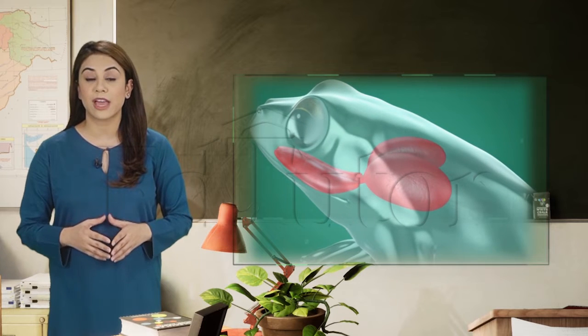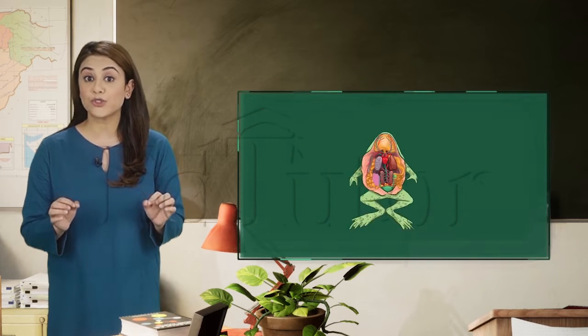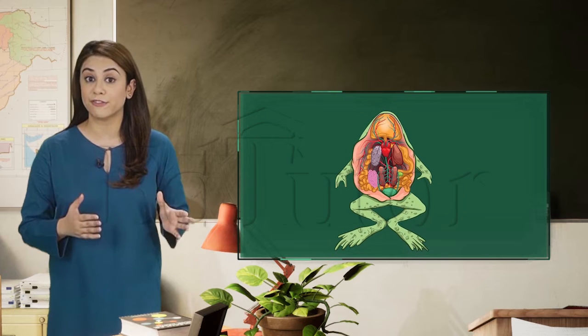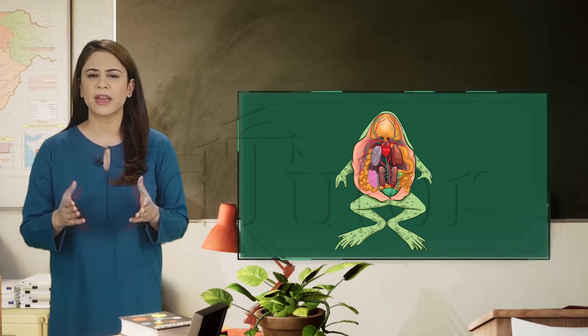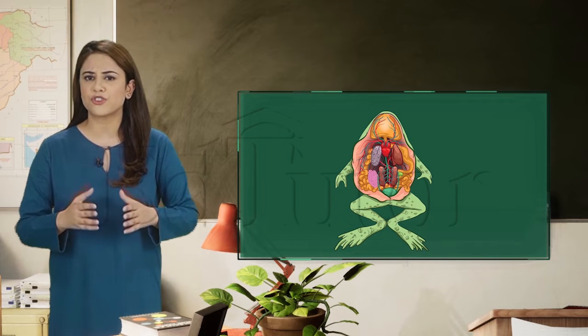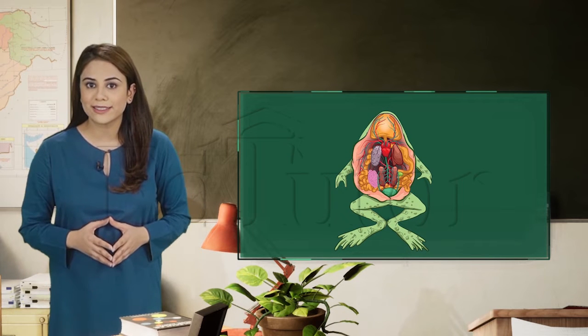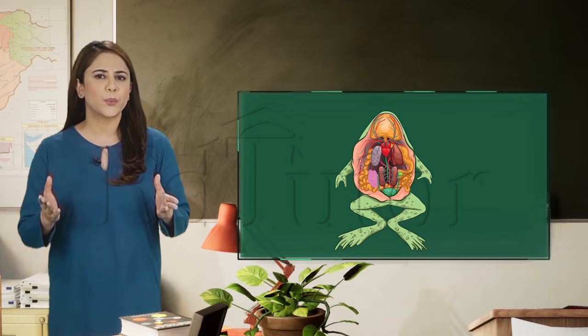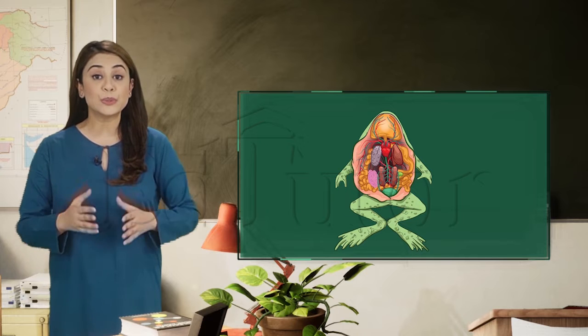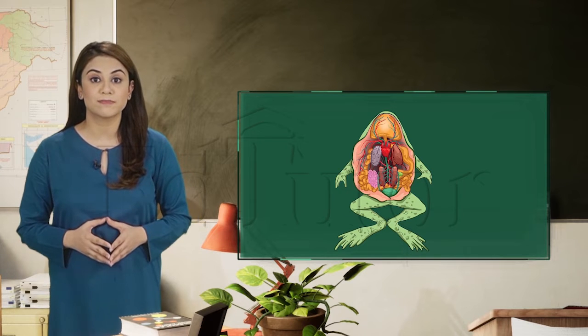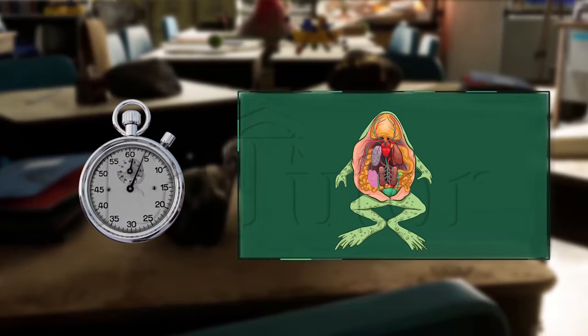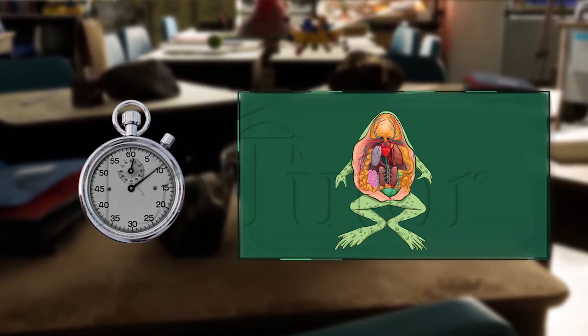Coming to the circulatory and respiratory systems and the chest cavity — can you tell which one is the left and right atrium and the ventricle of the heart? And where are the two lungs? I will give you 10 seconds to figure that out.